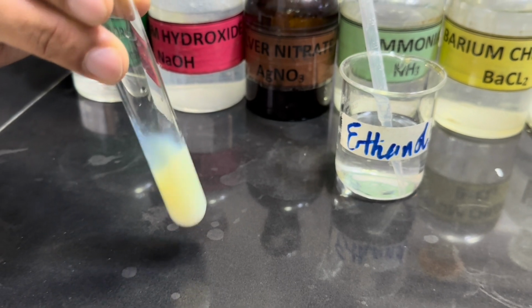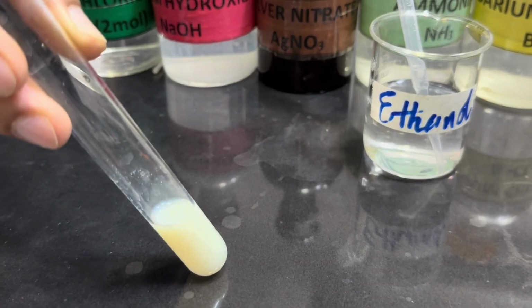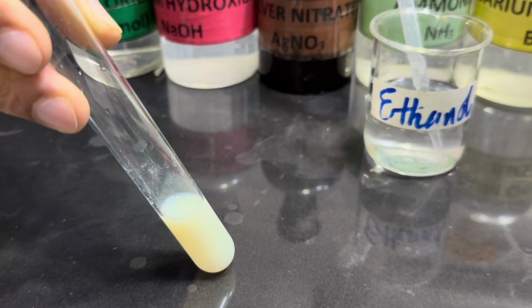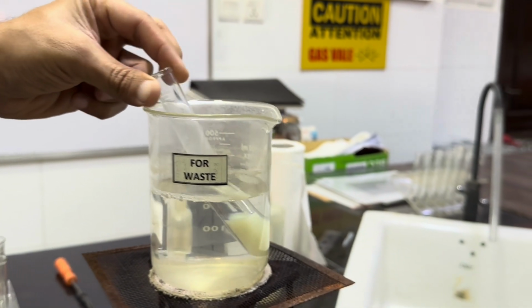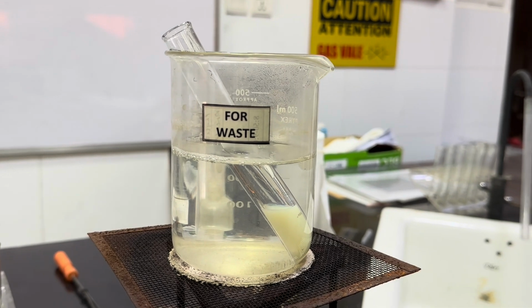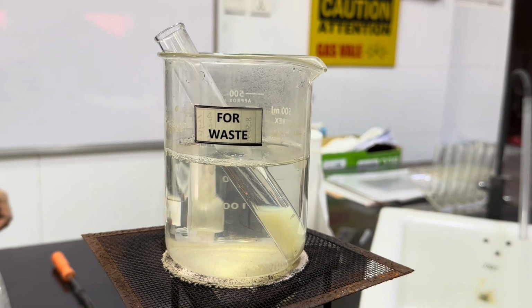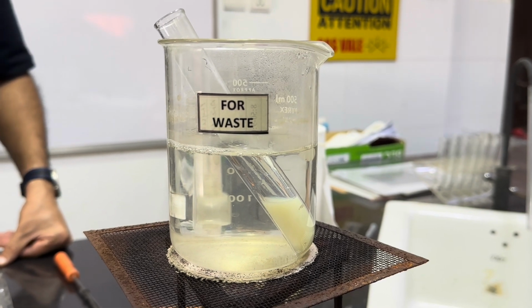We will swirl it a bit for mixing. And now we will put this test tube in a water bath. So here is the hot water bath, and we have put this test tube here. And now we will see what's happening with this yellow precipitate.